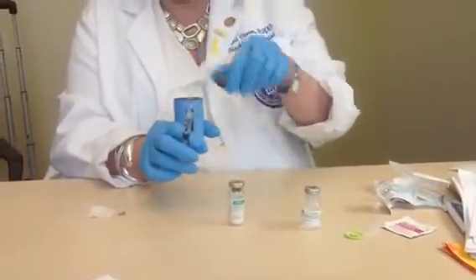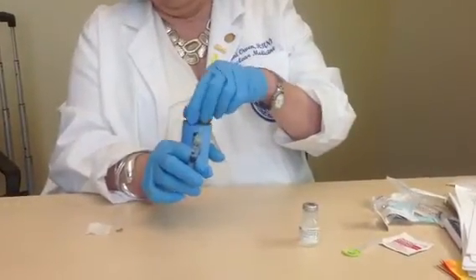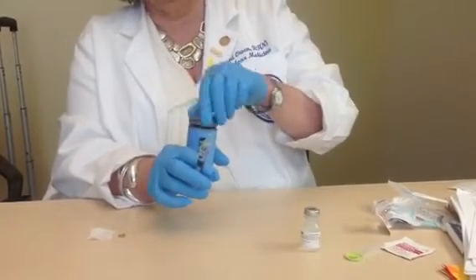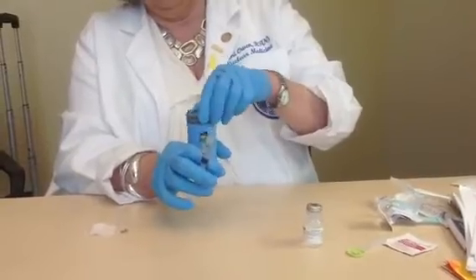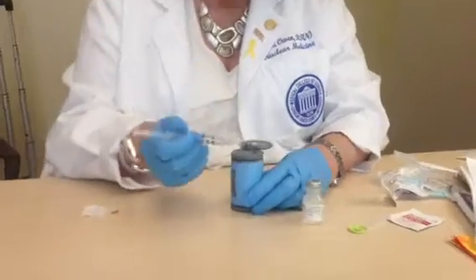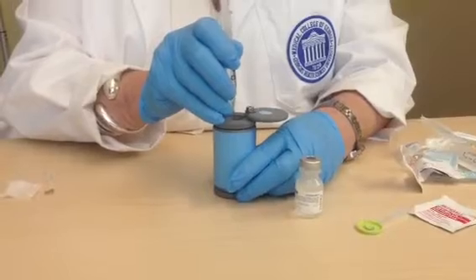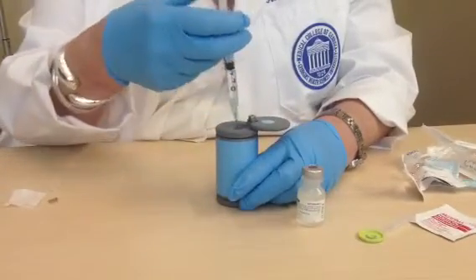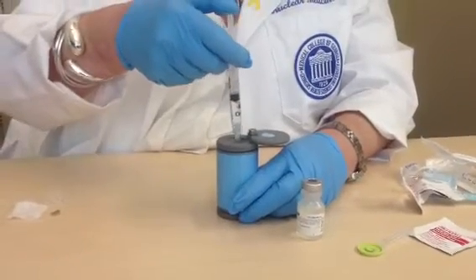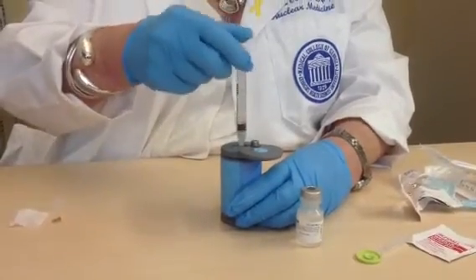Put this vial in here like this. I would not be holding this dose like this, and it actually would be in a syringe shield. But I can then very carefully add the 2 cc's of saline into the reaction vial like that.